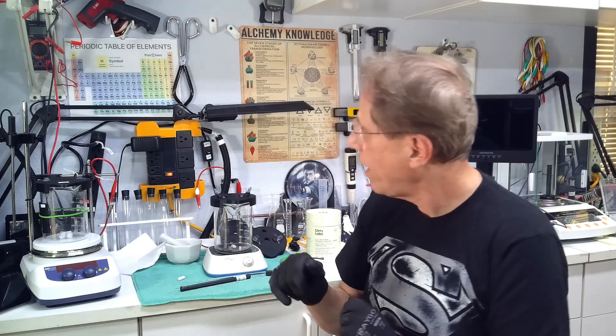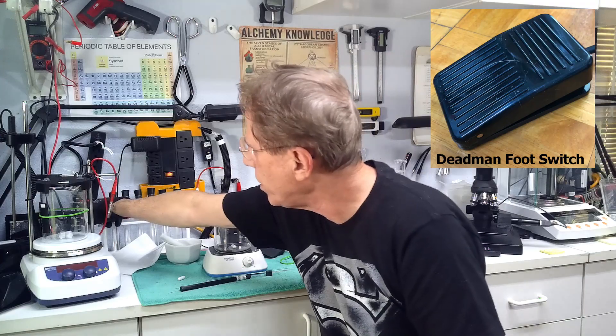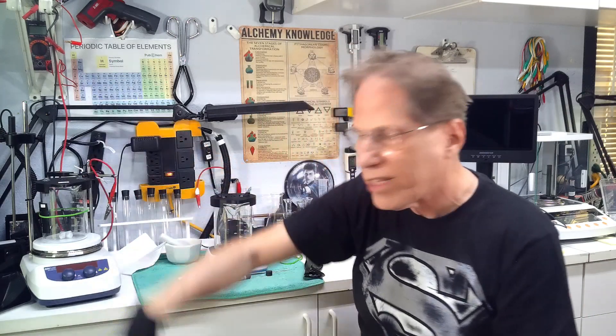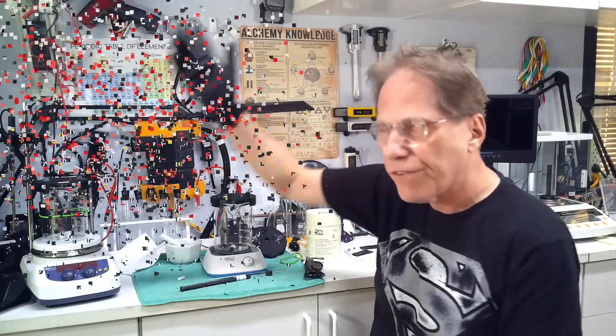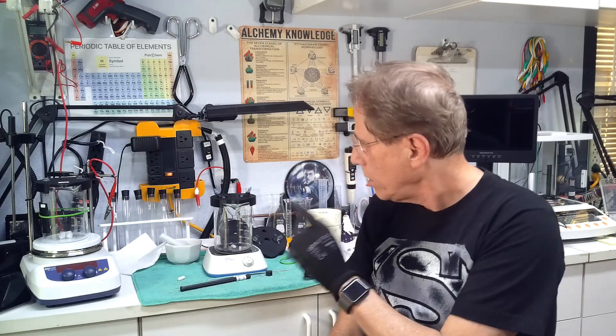Another safety feature is how you turn the plasma arc on and off. I use a dead man switch — it sits on the floor. I also have an arming switch. The arming switch sends power to the dead man switch, which then sends power to the transformer. Power is not applied unless I press the dead man switch down. If something goes wrong during the process, you just lift your foot and everything stops. Please make sure you have some sort of dead man switch in your plasma arc setup.